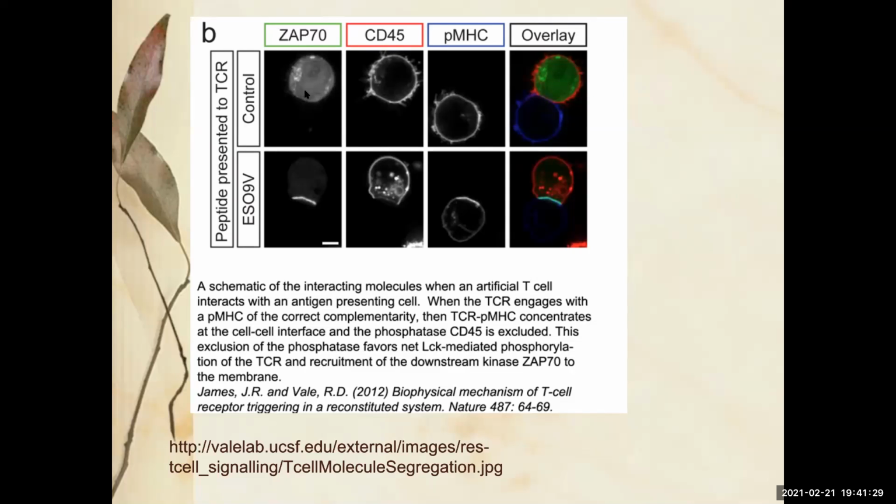And note that sometimes people will present these parts of their figure, parts of their image, or sub-images of their image, however you want to think about it, in color too. It's kind of a microscopist expert thing to just be like, I know better. I'm going to present the individual channels in black and white because there's more contrast. Your eye can see what's going on better. But then I'm going to give you the color because, of course, the overlay has got to be in color.